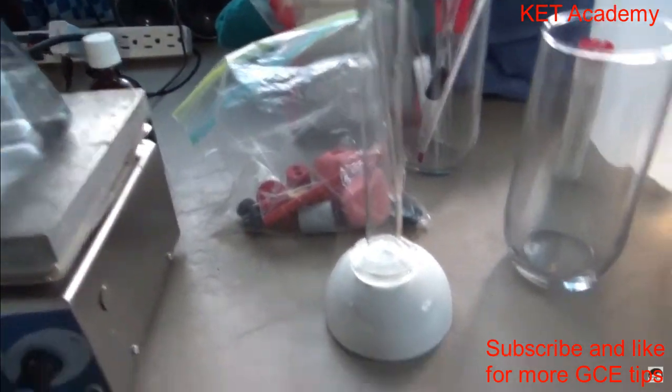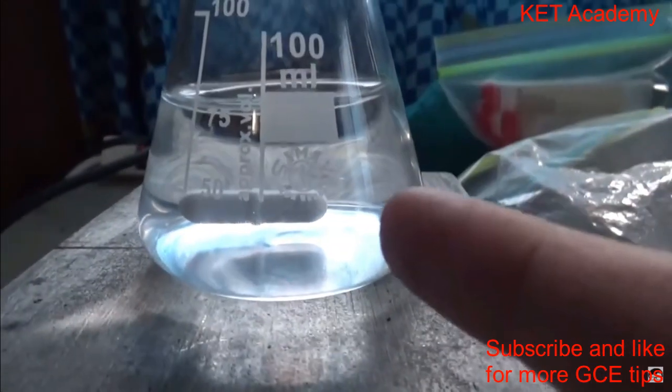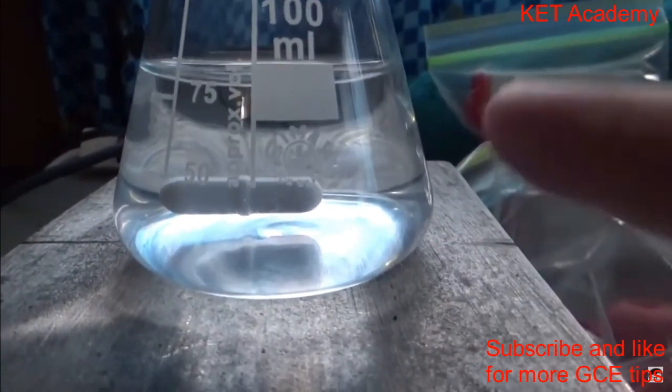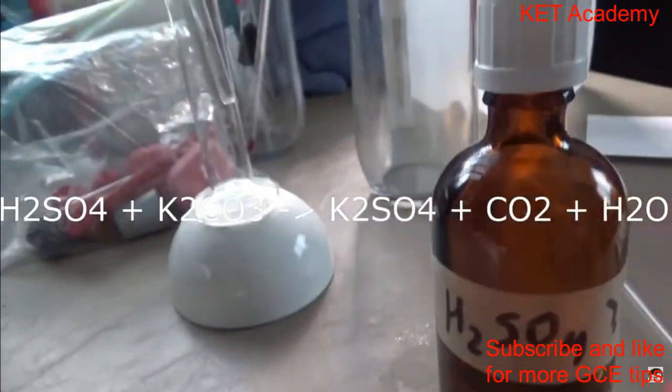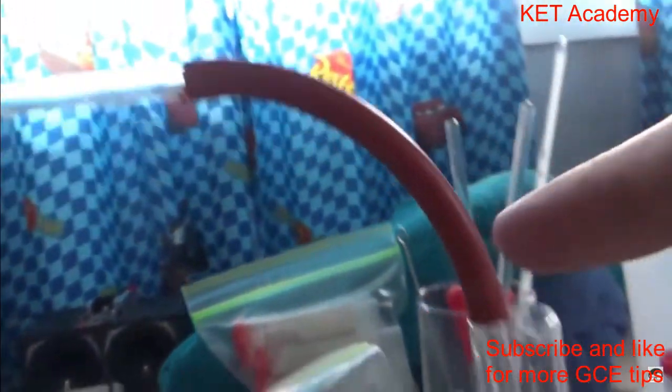Alright, the apparatus is now set up, so here is what's going to happen. Here's the chemistry. So we've got our solution in there, right? Which I'm assuming is a carbonate, more specifically, most likely potassium carbonate. What we'll do is we're going to add an acid. Today we're going to be using sulfuric acid, and we're going to pour that into the solution. What's going to happen is, if there is a carbonate present, the acid will react with it to form carbon dioxide. The carbon dioxide will travel up that tube, and down into here.